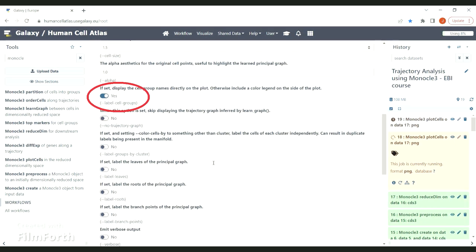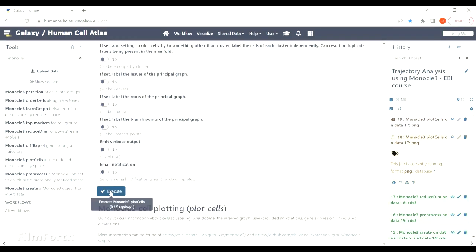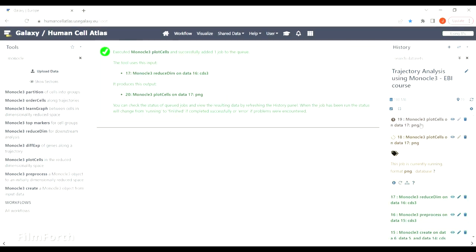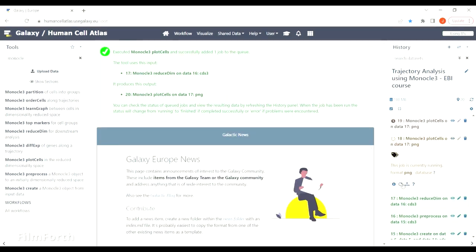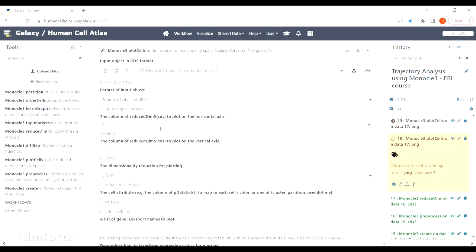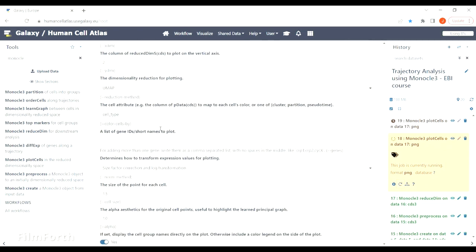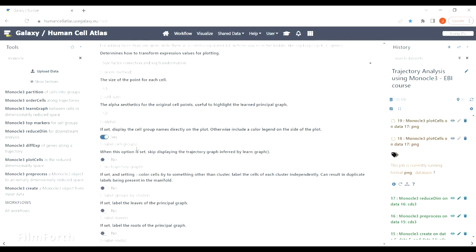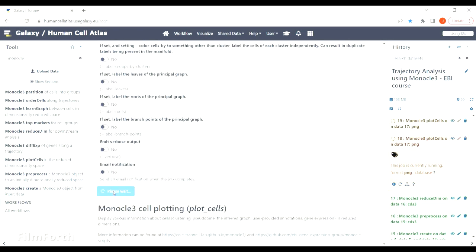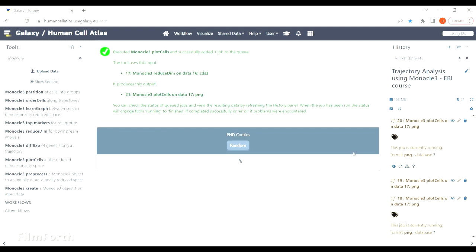Actually you can stop here and switch this toggle bar from yes to no in label cell groups, because otherwise you will get the labels on the plot and that won't be very legible, which you will see in a moment.